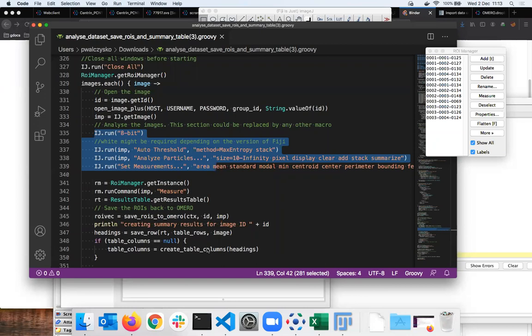when you are viewing an image in the web, we're loading one plane at a time. You can also do that if you want to only analyze a plane or a given channel. We have plenty of examples of that. And after that, you apply the macro.